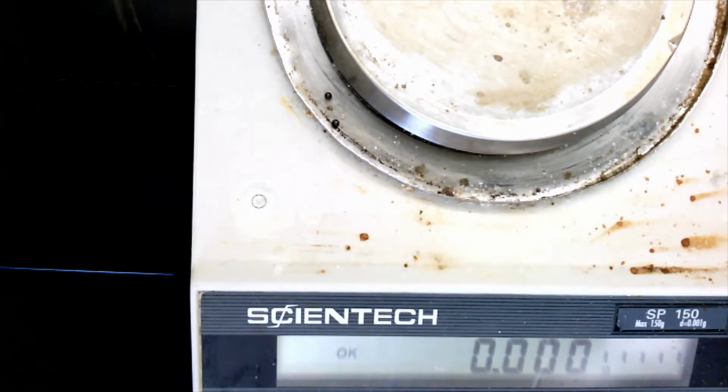Okay, and we'll do the same thing with procedure A. So my procedure A is almost done. I just need to let it cool, and then I'm going to come over and record that mass, and that will be the end of the video. Then the rest of the activities, the rest of the calculations, exercises you can do on your own.